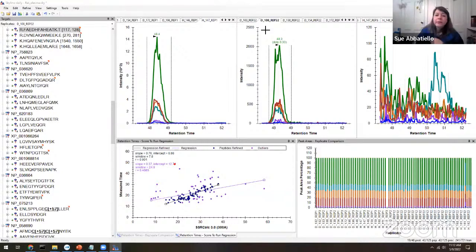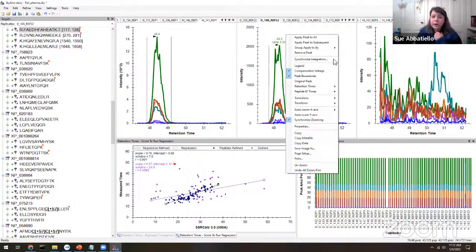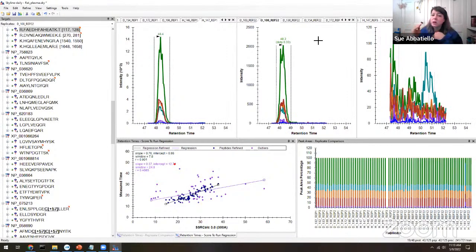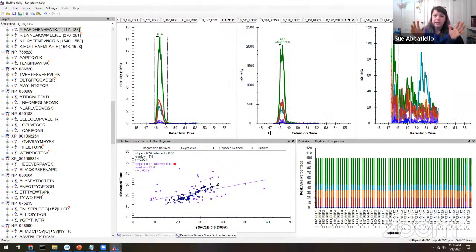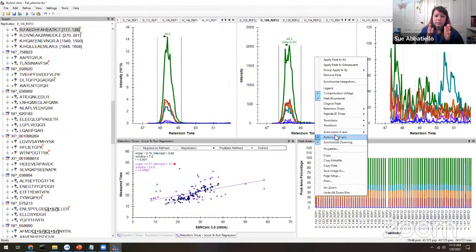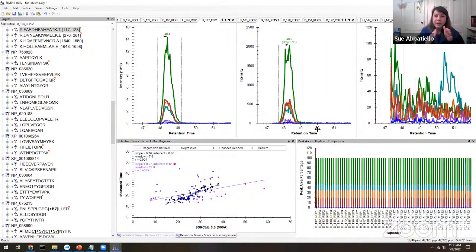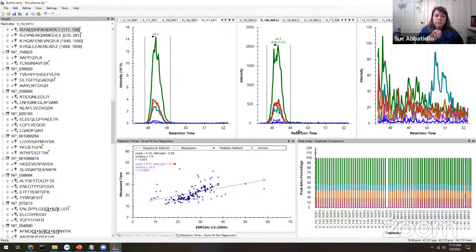Just be careful on that one. So Lindsay, right click in there again in the chromatogram. I think you have the y-axis auto scale turned on for best peak, so the y-axis isn't changing when you do that synchronized zooming. You have to turn off the auto scale for the X and Y in order for everything to adjust properly at the same time, both dimensions.